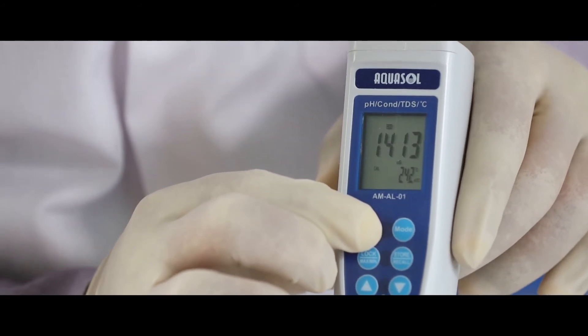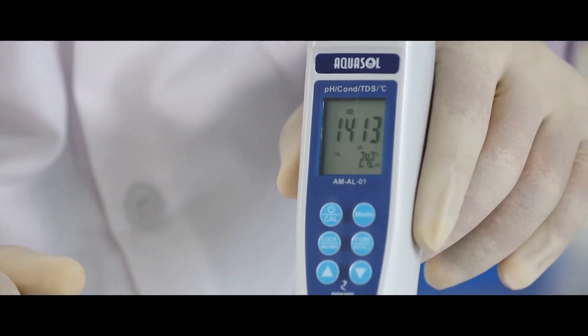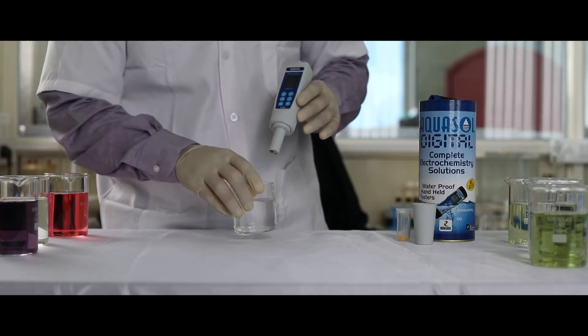Once calibration is done, device will display SA and END. Once we rinse the electrode with clean water, we can check the conductivity of the sample acquired.